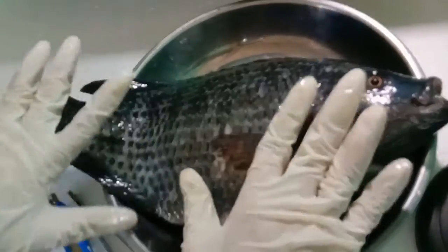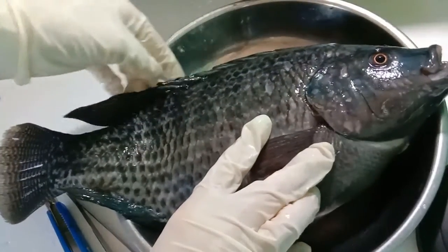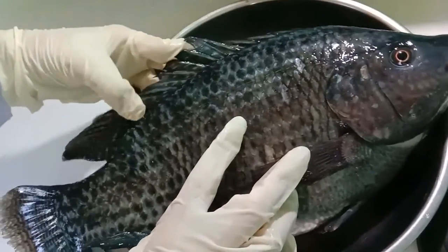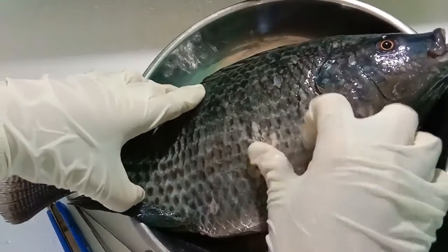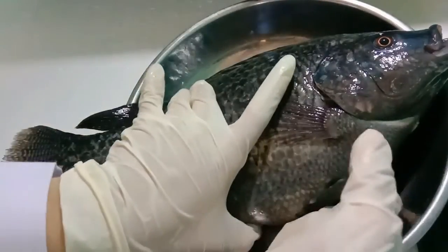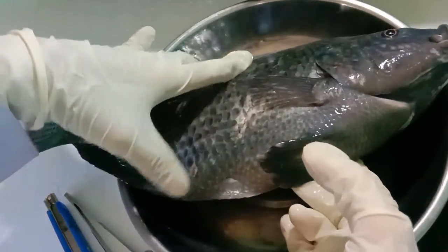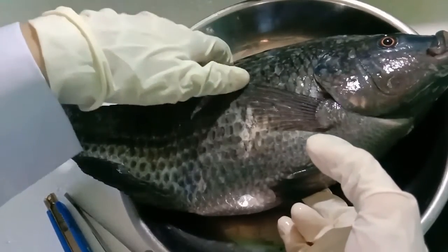We can see that there are various kinds of fins on the trunk, including the anterior dorsal fin here, and the posterior dorsal fin, which are on the dorsal side. So the soft dorsal fin is between the bones of this dorsal fin. Next is the pectoral fin, which functions to move forward, sideways, and stop, and to turn left and right. Pelvic fin here. Pelvic fin or ventral fin, which is located on the belly of the fish, serves as a balancing tool so that the fish position is stable. The importance of dorsal, pectoral, and pelvic fins is to assist in the turning movement and reduce the rolling over of the fish.